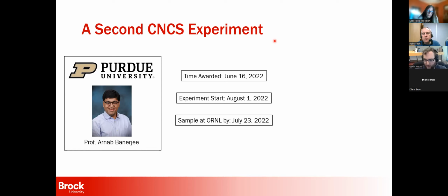Purdue is a very big, prestigious university, so they have a ton of scientific equipment. In fact, they do have a Laue on their campus, but it was across campus. And it turns out that the Laue they had, which was not a Photonic Sciences Laue, was not able to do the job we needed it to do, co-aligning these crystals. We had ordered one for our lab at Purdue from Photonic Sciences, but I think we had only ordered it maybe a month before this time was awarded. So there was no way it was going to arrive in time, especially with COVID delays still happening.